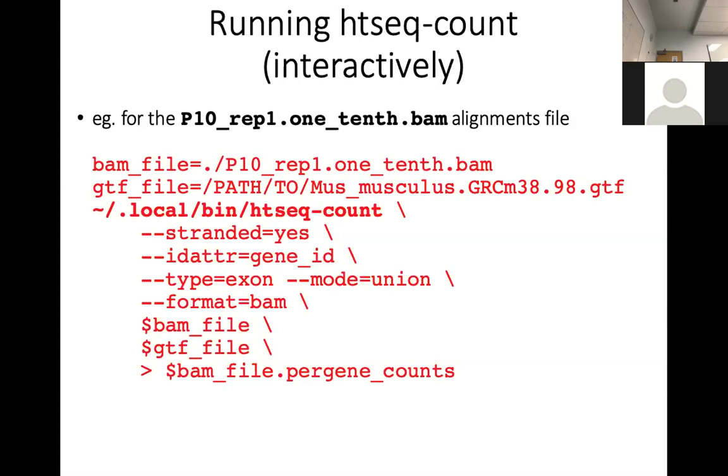It almost works, but they always say that this is regardless of where it exists. So that's not the problem here actually. What was the error on the directory?